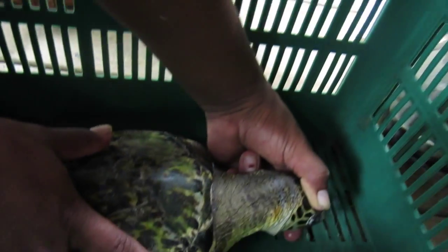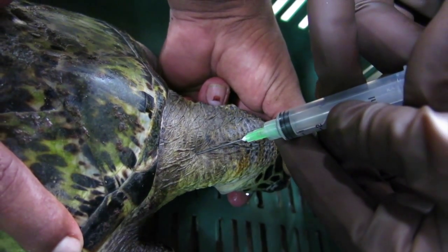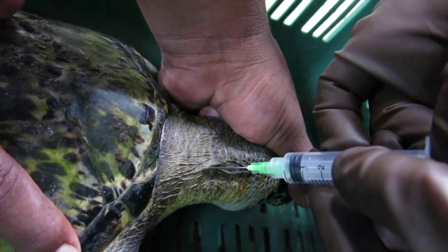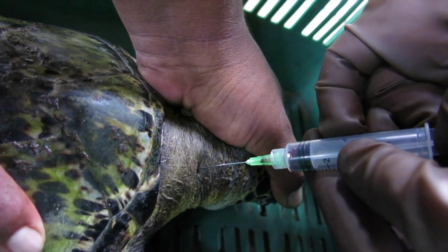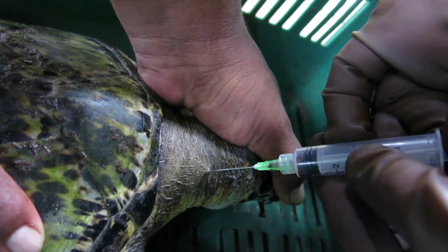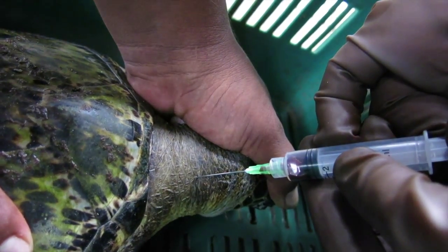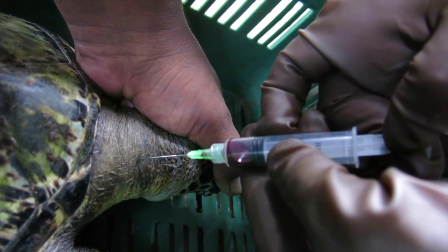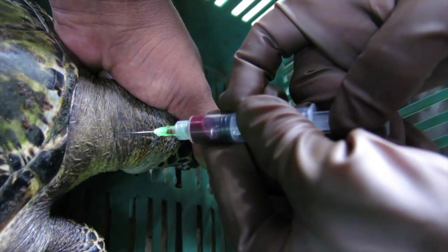We're going to go in just a little bit, about a quarter of an inch or so underneath the skin, and we should be able to get the cervical sinus. We go right in about here. It's quite shallow on these little juveniles, so you've got to almost come back to the surface when taking the sample.